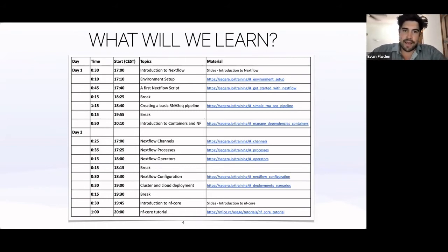The way we're going to do the majority of this workshop is we have a cloud environment which is pre-configured. This is an interactive development environment. It's essentially a terminal in the cloud. And this way everyone starts with the same environment. You just need a browser to be able to access that. We'll spend 10 minutes or so after this setting that up, installing all the things that we need, and then kick it off from there.